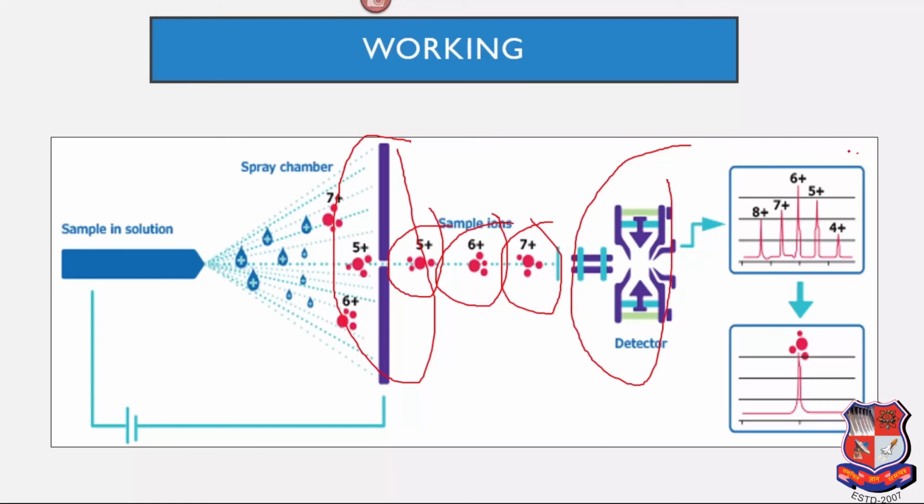We can see that at the detector, we get different kinds of ionization groups in the detection. So from mass spectrometry, which gives the mass to charge ratio, we can find out in the whole sample how much impurity there is. By this method we analytically measure the amount through spectrometry.